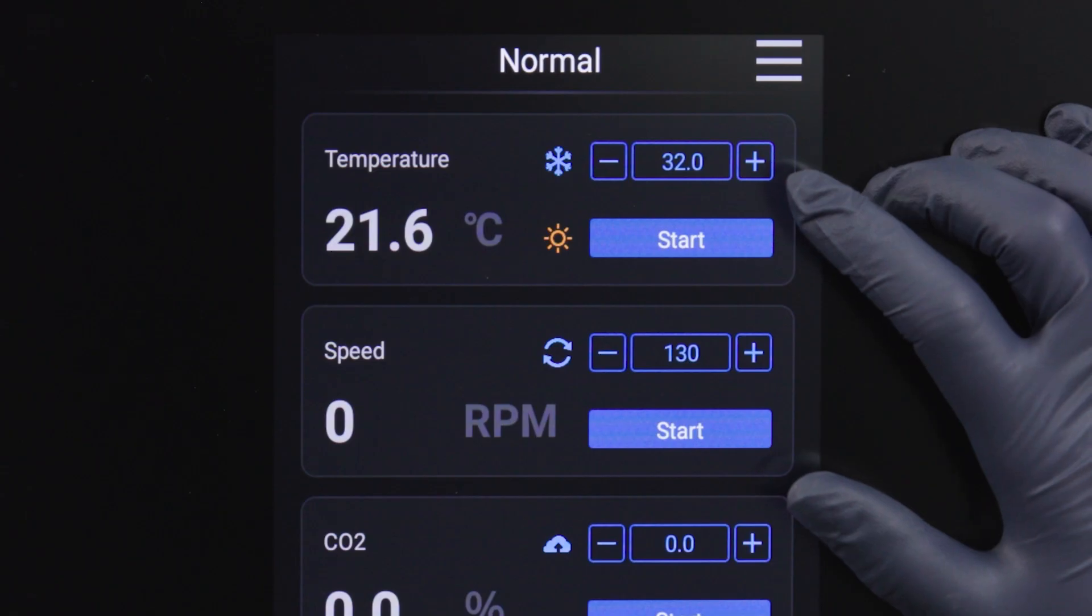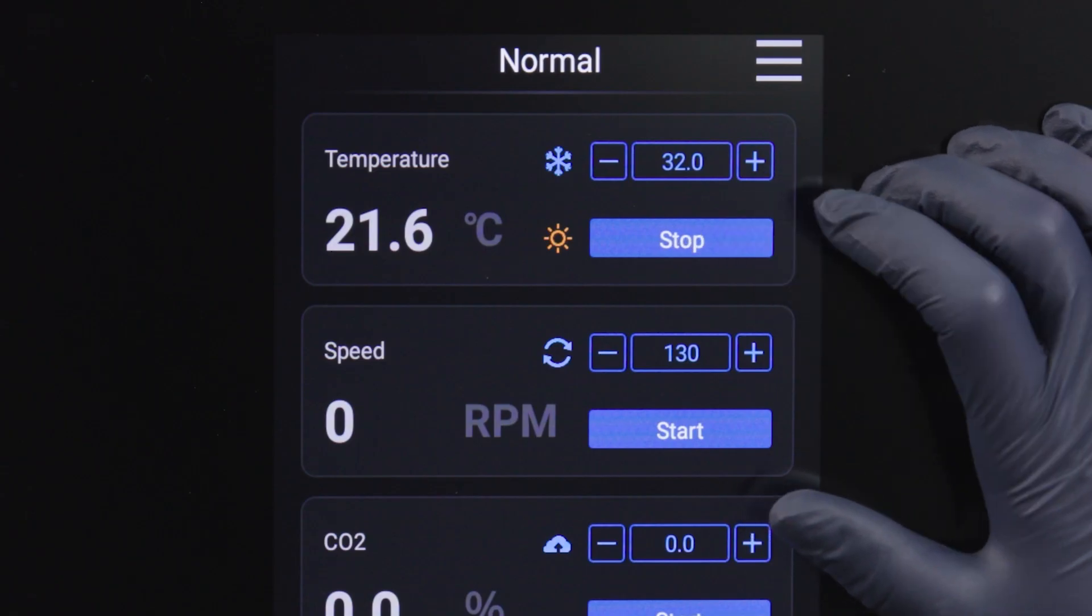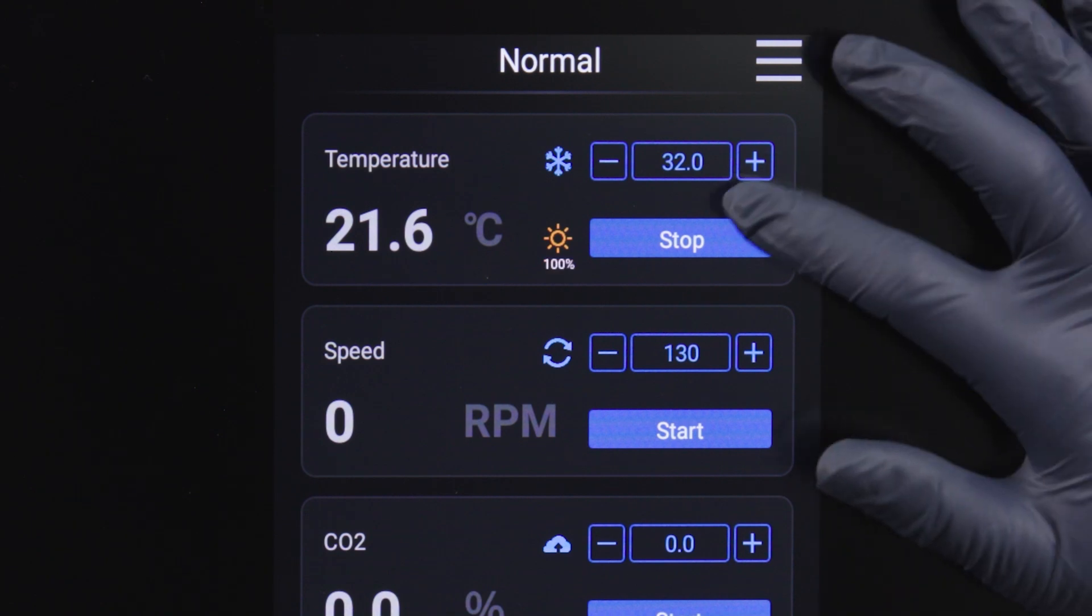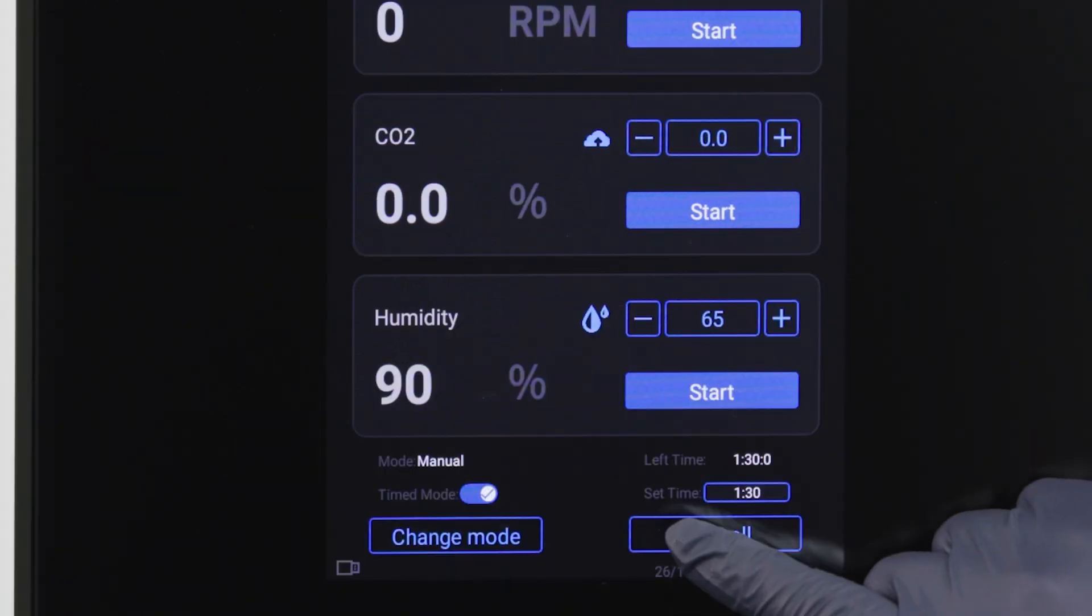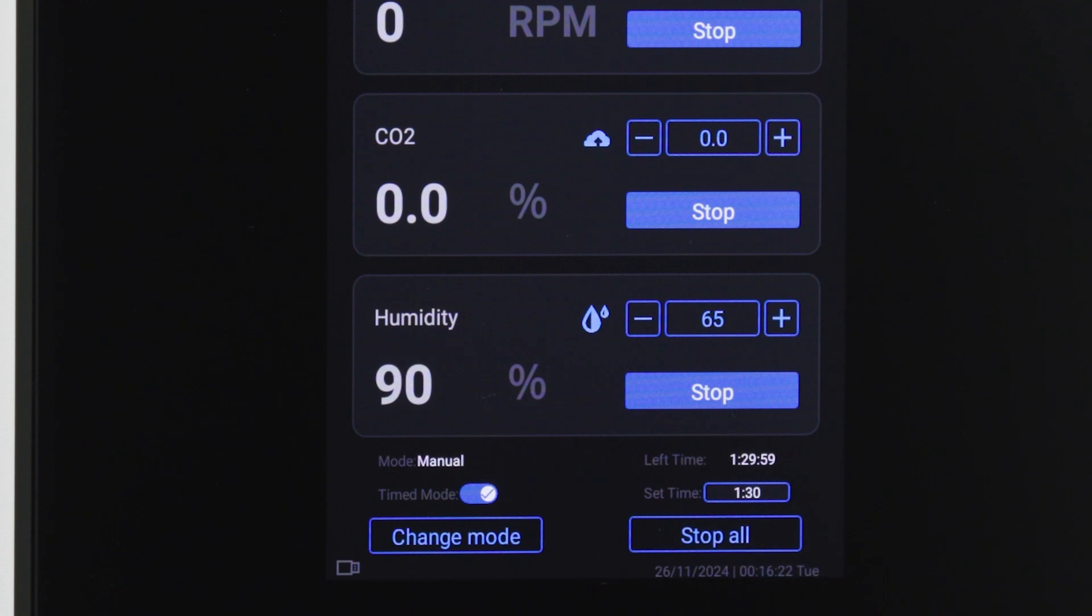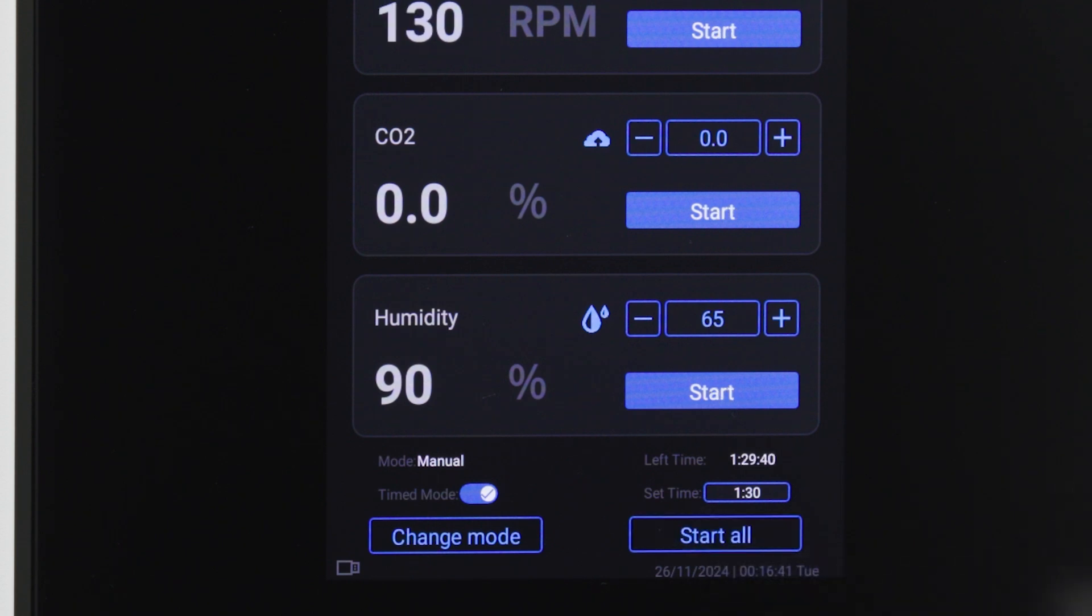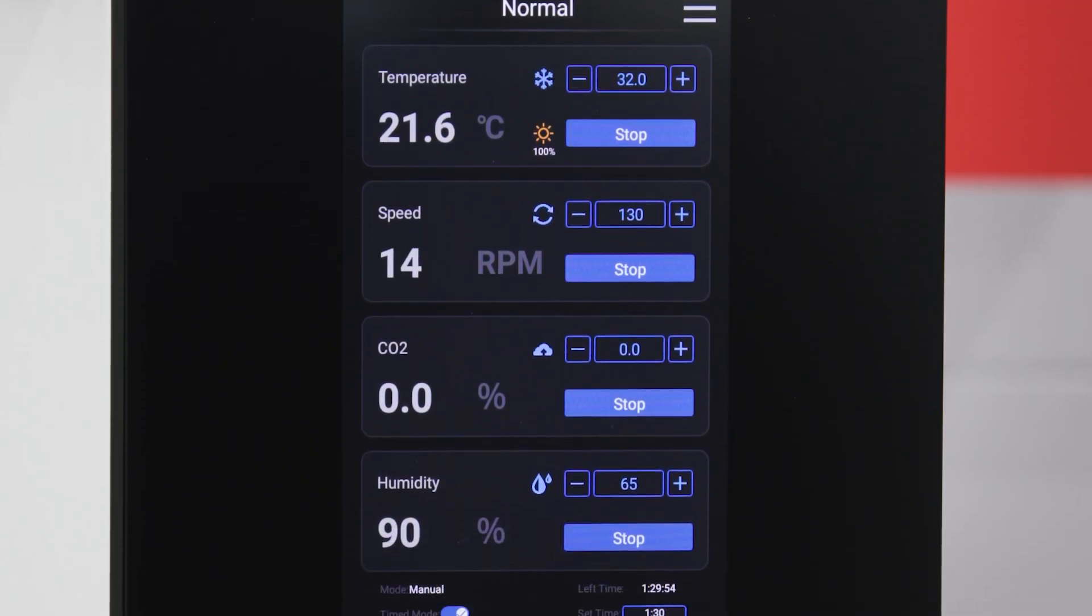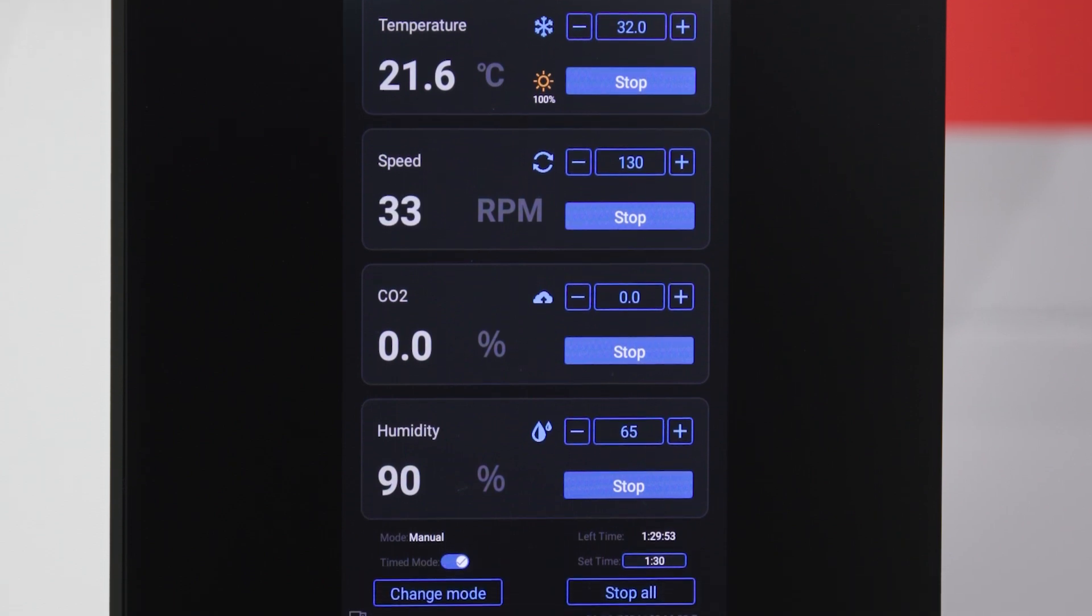To start or stop an operation, press either the start or stop button in each panel or the start all or stop all buttons at the bottom of the interface. This option allows you to run all parameters or select the ones you'd like to run.